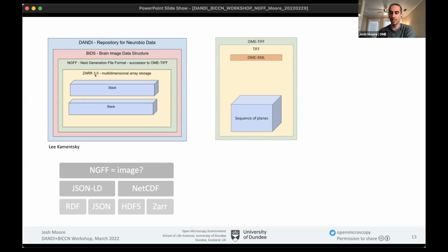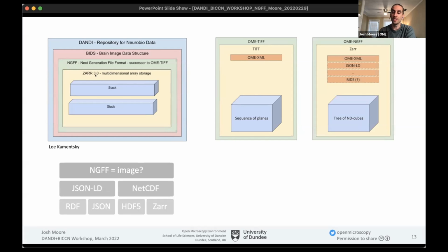There's a bit of a downside in TIFFs that you can only add metadata in one location, currently in the image description, and different applications like Micro-Manager disagree on how we're going to store that. If two ecosystems want to own the file, what do you do? I think with the NGFF, since it's hierarchical, we actually have the potential of going, okay, can we have a multi-ecosystem file format? So you take the Zarr, you put the OME-XML somewhere. From my point of view, that is now an OME-Zarr and OME-NGFF. That's great.